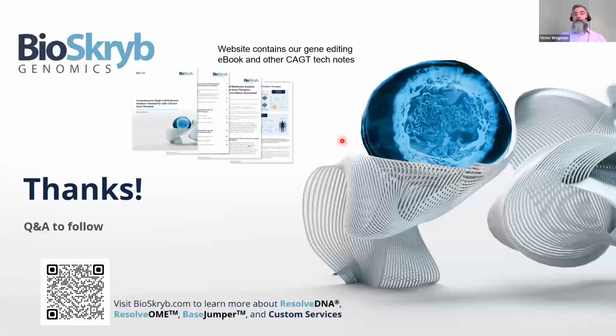But what I showed in a bunch of different figures here is that for these off-target events happening in maybe 15, 20% of the cells, if those are hit, then they're going to be happening in 7 to 10% of the cells. You're starting to hit the noise level that you get with bulk sequencing. And if you've sequenced your model system, you understand where these edits are happening, both on target or maybe off target if you're doing a non-targeted approach.